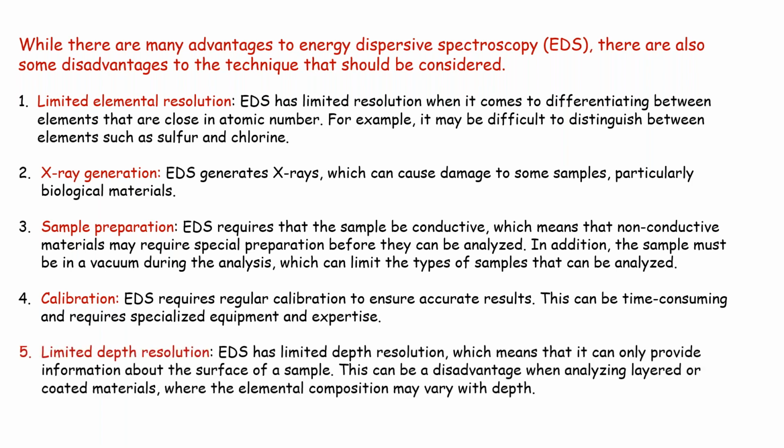and limited depth resolution. EDS depth resolution is limited, which means that it can only be used from the surface of the sample. This can be a disadvantage with layered materials, coated materials, and if elemental composition may vary with depth.